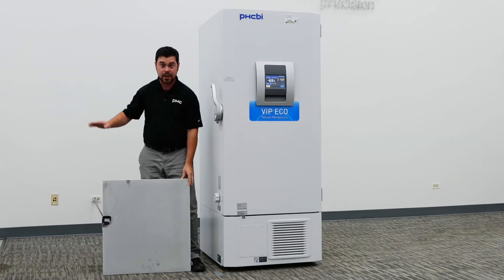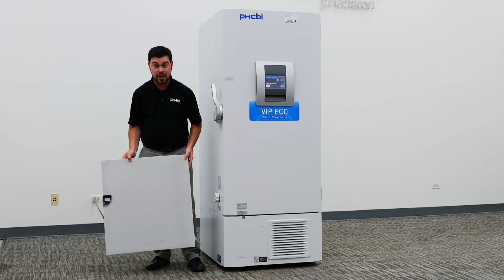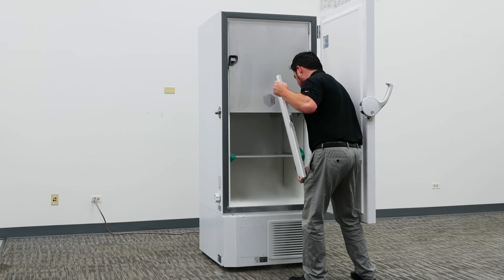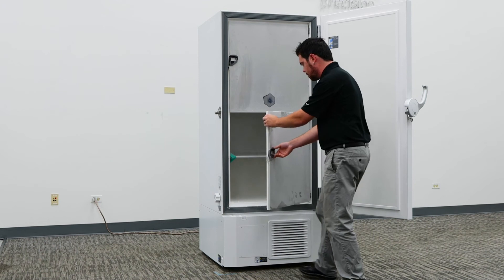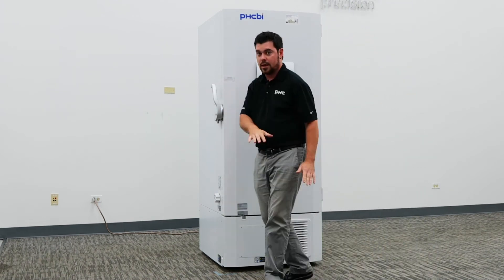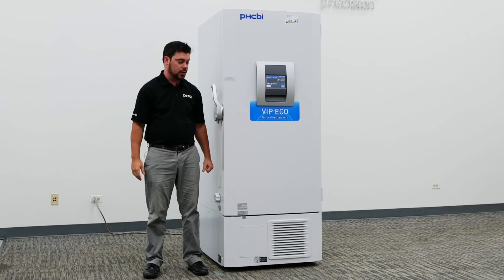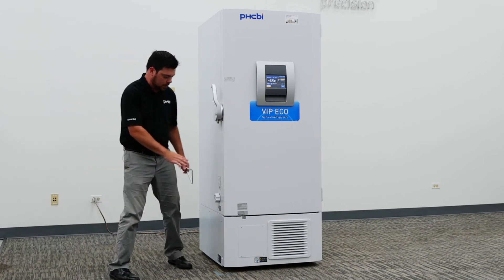Once the door is removed and draining for a period of 24 to 48 hours and all frost buildup has been removed, you can follow the same steps to place the inner door back onto the hinge pins. That method of removal is used in the event that you're not able to fully defrost the unit, which we do recommend doing at least once per year.